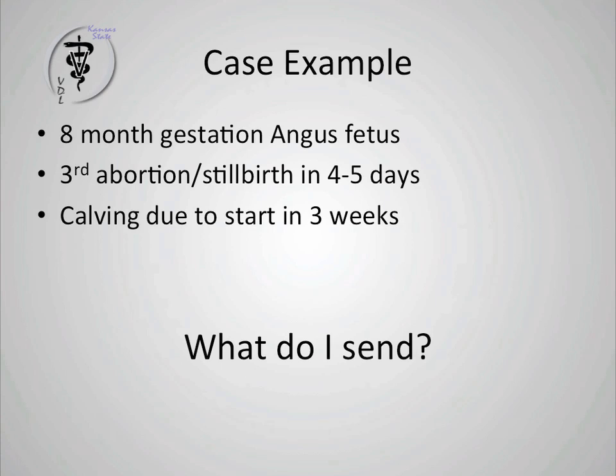I also had a submission 2 weeks ago. I've never had this happen, but it was actually pretty clever. I don't know if the person who sent it is in the room, but they actually cut the legs off and just sent the rest of the calf. It fit in a much smaller cooler and it weighed less. So as long as you're not going to come back later and ask me if I saw arthrogryposis, then we're fine. So that works. All the samples were there. It saved them money. So that worked out quite well, actually.